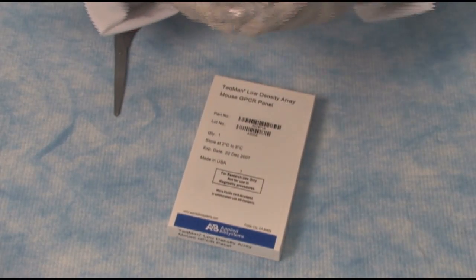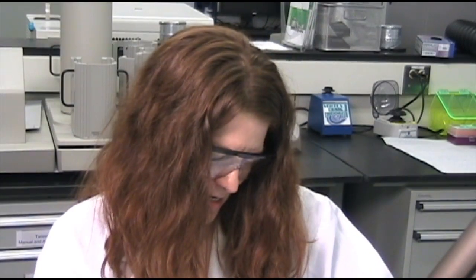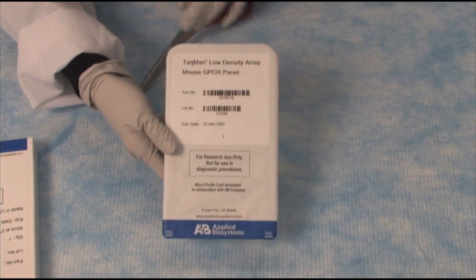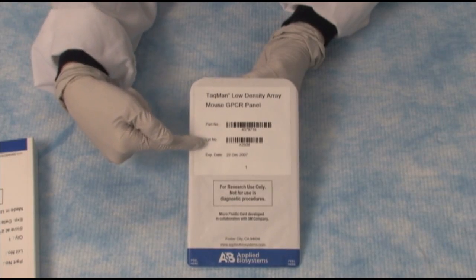Now let's run our TaqMan Array card. As you can see, these cards are stable at room temperature — they ship that way and you can store them that way. Here's how the product looks when it first comes out of the box. All the TaqMan cards are barcoded with both the part number and the lot number.